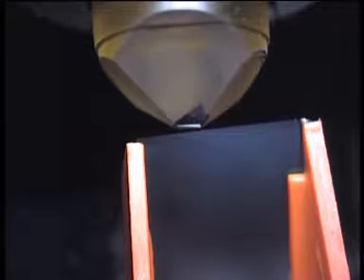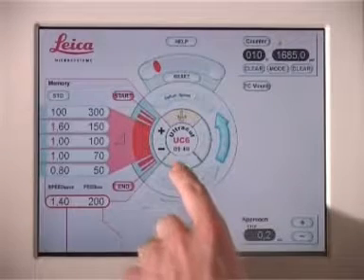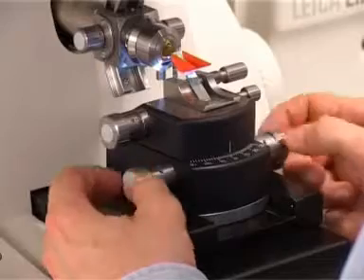Using the track wheel, the knife is now moved towards the sample while observing it through the stereo microscope. Before sectioning can begin, knife and specimen have to be aligned.